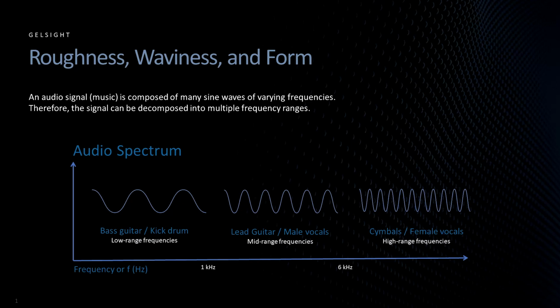If you ever adjusted the bass and treble settings on your car or home stereo, I'm sure that you noticed that you can boost or lower the frequency content that most suits your taste. Decreasing the level of a signal is known as attenuation. I'll be talking more about that in just a minute.